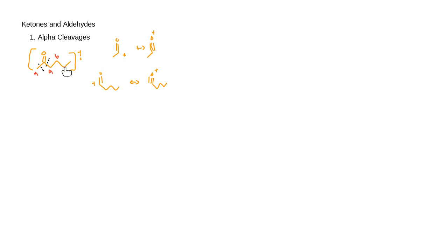So nothing really special. The reason why alpha cleavages are talked about is because you want to cleave right underneath the oxygen because it provides stability, it provides the resonance it needs to make that happen. That's why if you only need to cleave a methyl group, you choose this one and not this one. So really make sure you understand why when we only subtract 15, we're not cleaving right here, we're cleaving right here, because of the stability. Okay, hopefully that made sense.